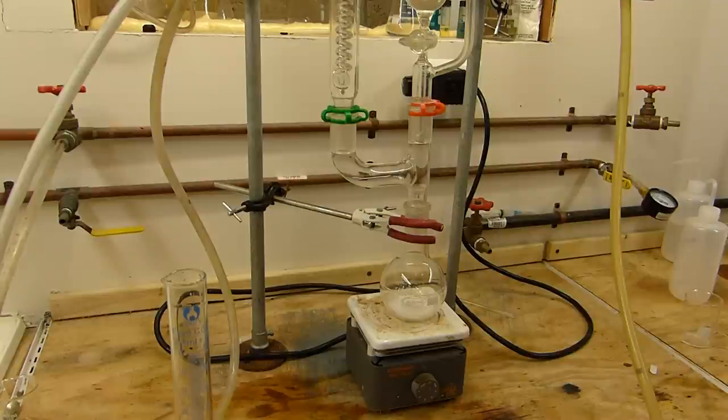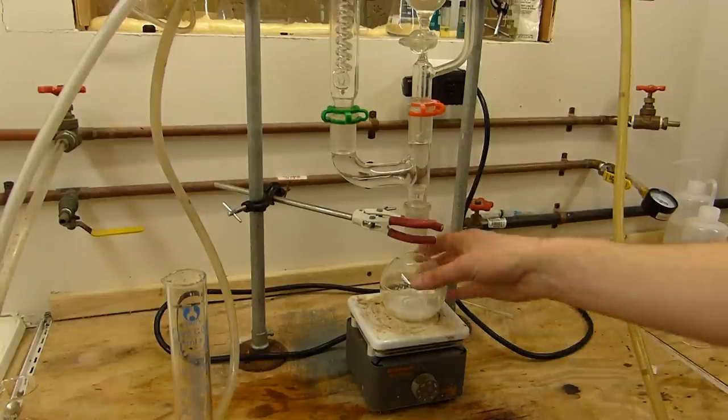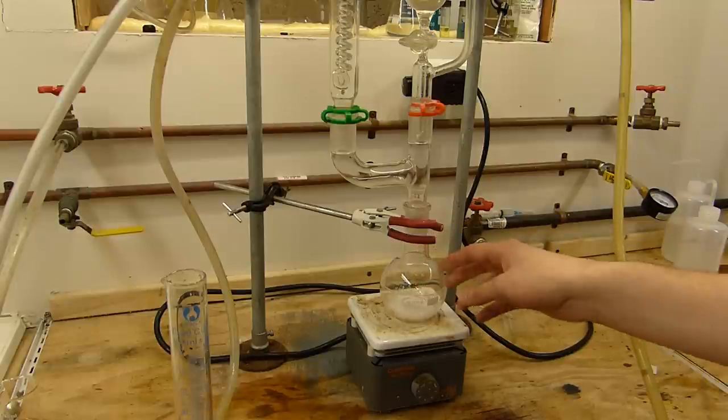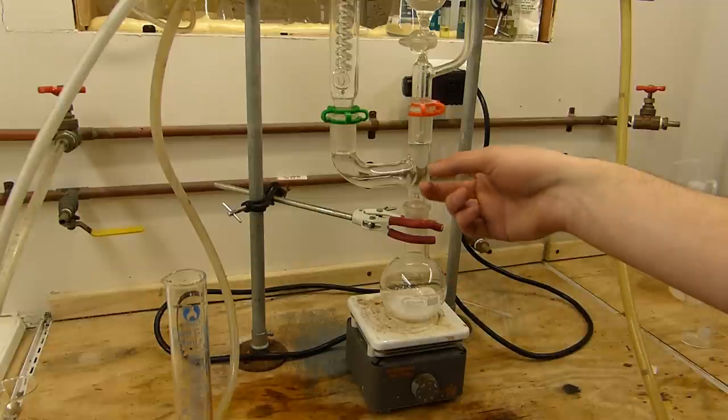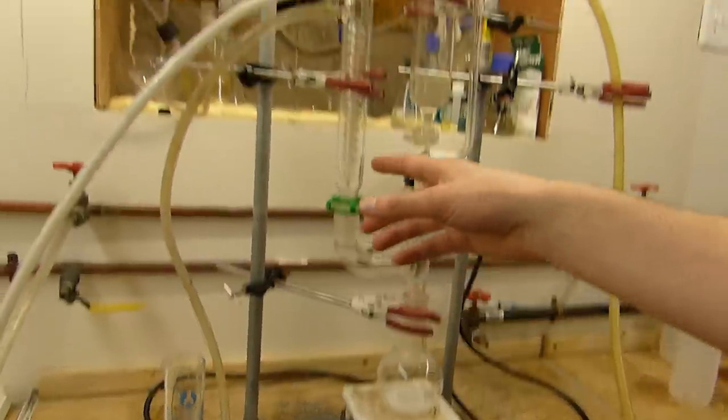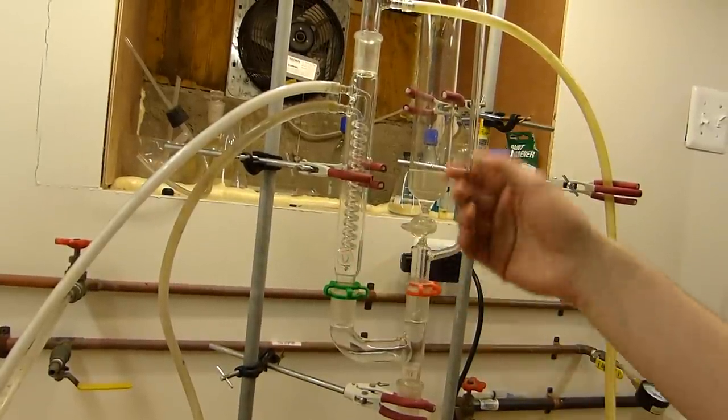You can then set up the ammonia generator. On top of a hot plate, which you'll need to heat the solution during the later stages of the reaction, you put the flask, in this case the 250 milliliter with the 9 grams of sodium hydroxide in it, a Claisen adapter, and then on the Claisen adapter, we have first a reflux condenser here. This happens to be a coil condenser, but any reflux condenser will do.